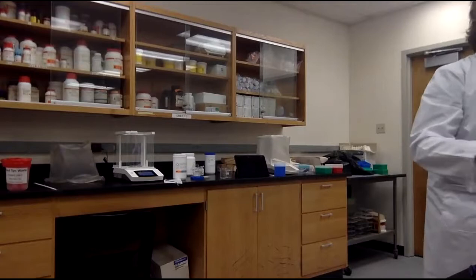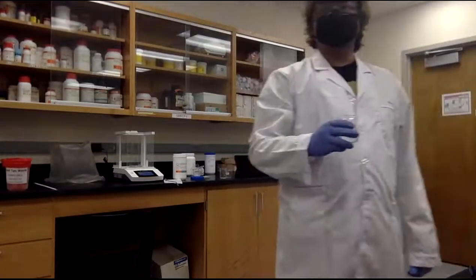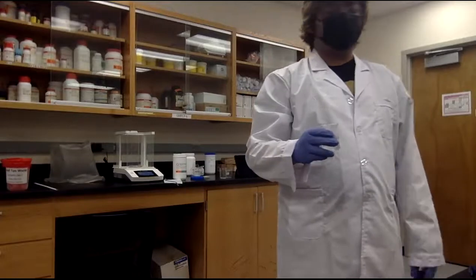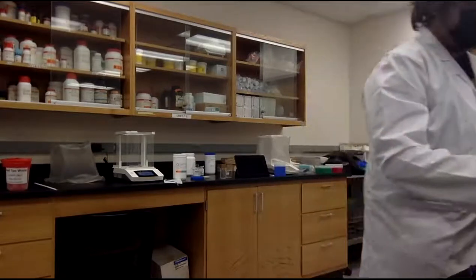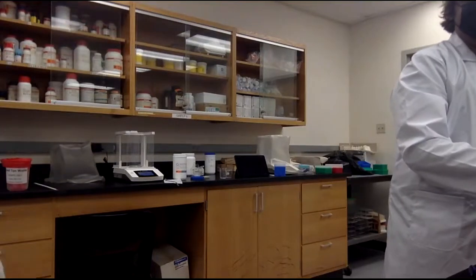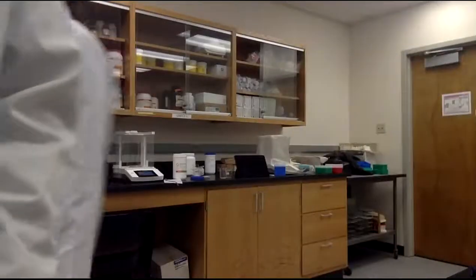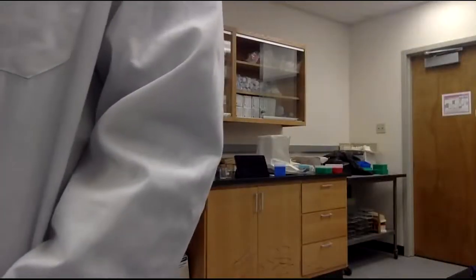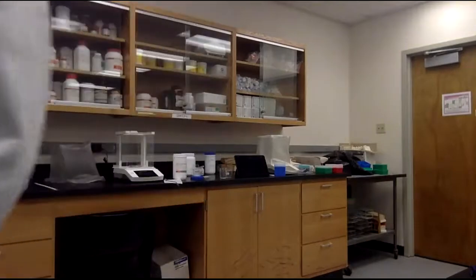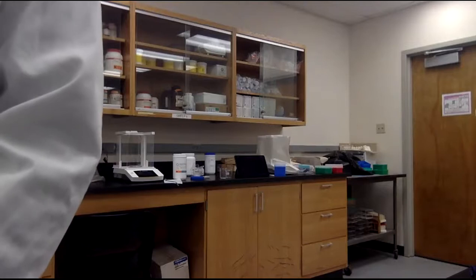No, you pour it into the fume hood. Or you can just leave it here. You pour everything out at the very end, just grab a new beaker, then restart. Yeah, because we barely had any sodium hydroxide, so it should be fine, right? Well, you'd better pour it in the liquid waste. Yeah, that's fair. You can leave it here because you need to clean up at the end of the lab. So you just grab a new one and redo from the very beginning.